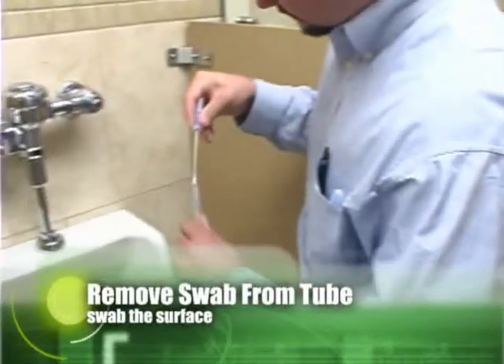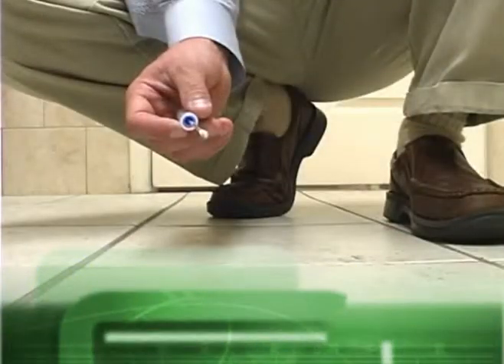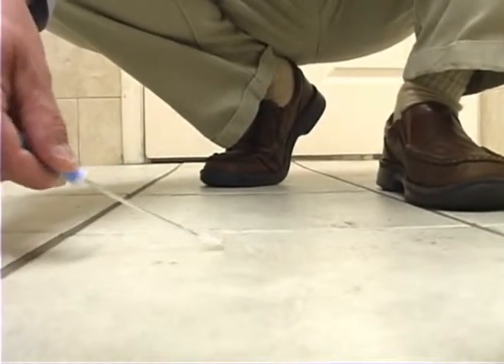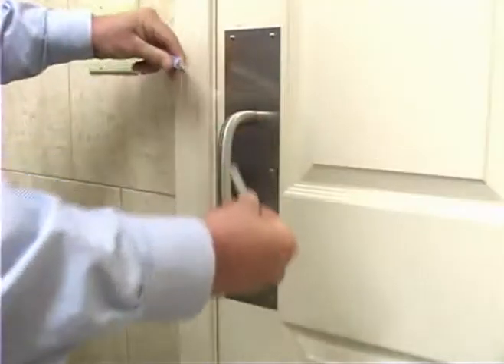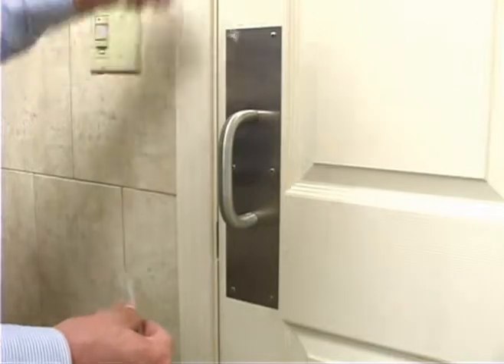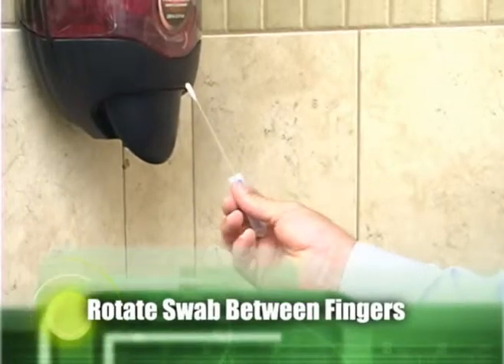After the unit calibrates, remove a fresh Ultrasnap swab from its swab tube and swab the surface. For flat surfaces, swab a 4 inch by 4 inch area by rubbing the swabbing tip back and forth across the surface and again in the perpendicular direction. For irregular surfaces, such as fixture handles and door knobs, swab enough of an area to collect a good sample. For best results, rotate the swab between your fingers while swabbing the surface.